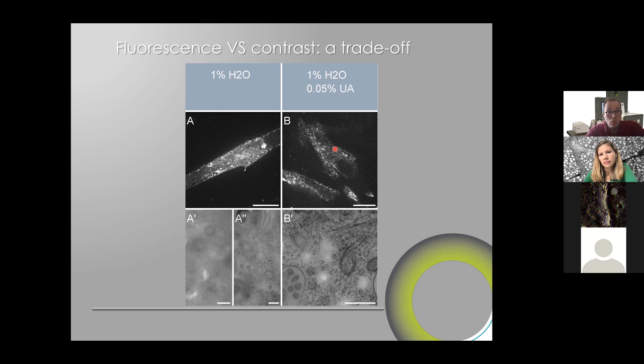And having no contrasting agent in the resin makes no contrast, and somehow it's charging the same way under the electron beam in SEM. So what we have to keep in mind is that the resin itself is not conductive, but in combination with a heavy metal salt, it starts to have conductive behavior. One of the interpretations we have is that the resin behaves like a semiconductor.